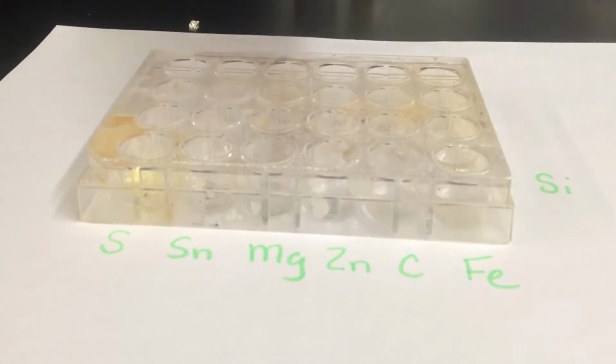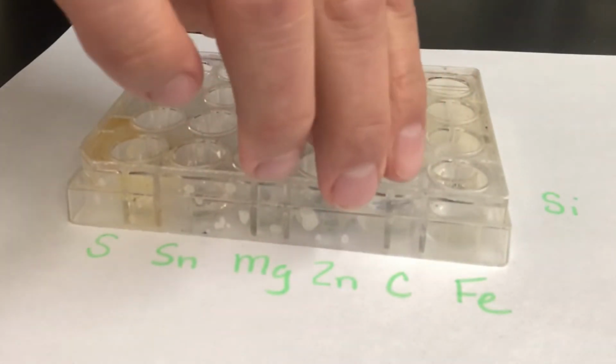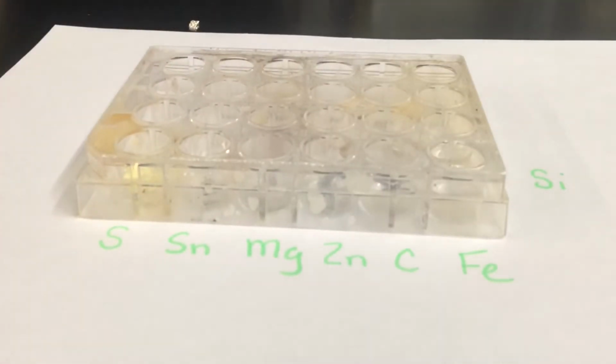I'm going to put a little bit of zinc. I'm also going to put a piece of carbon, so my graphite. I'm also going to put a piece of iron in hydrochloric acid as well, since we're testing to see if it reacts with acid. Last but not least, I'm going to put a piece of silicon in this last well.